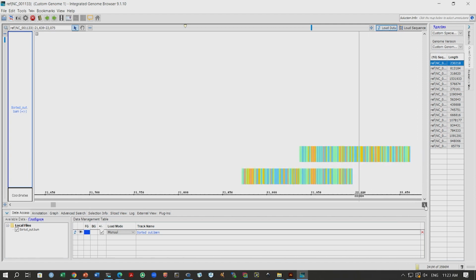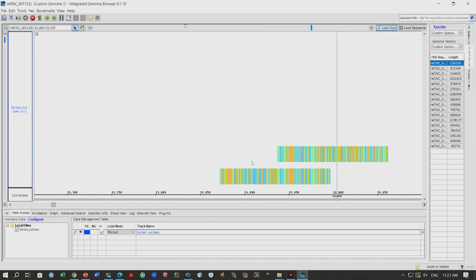You can see this for some regions. So, here is one region where you see these two reads, but here on the left side there is no read mapping. Remember, we are working with that small data set, where we only took about 25,000 paired end reads. So this is expected; 25,000 reads will not be able to cover most of these positions. Okay. All right.